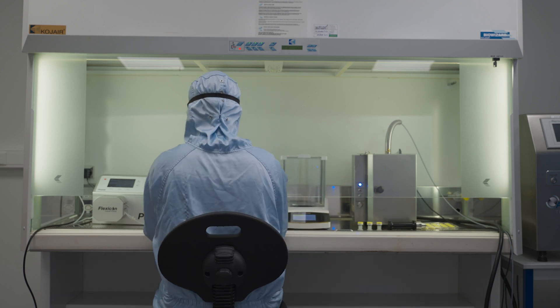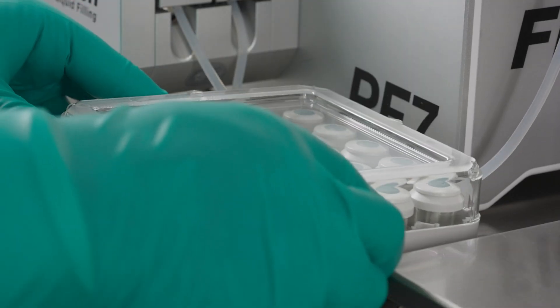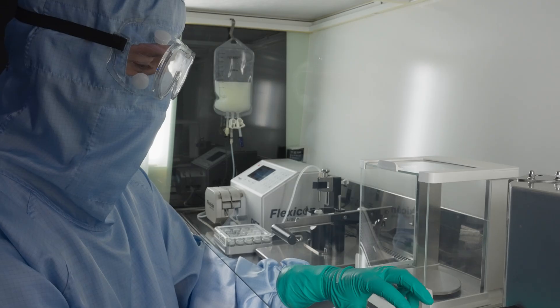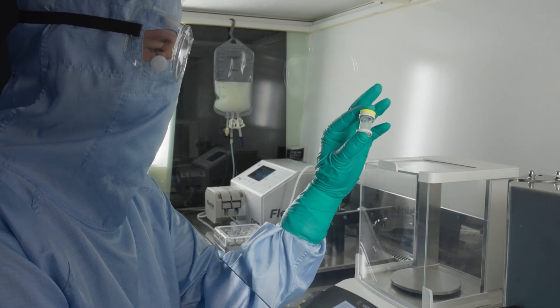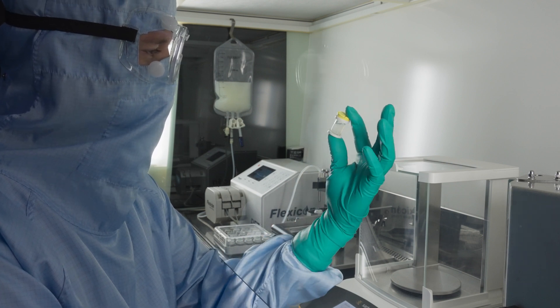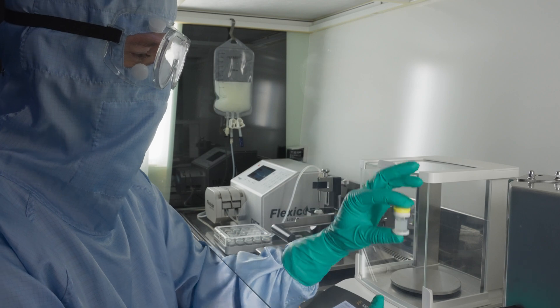The Crystal M1 fill-in station is utilized with the AT closed vial, the polymer container supplied with a stopper in place. With the M1, these vials are individually filled through the stopper, laser resealed and capped.